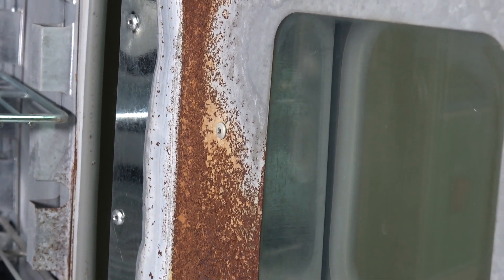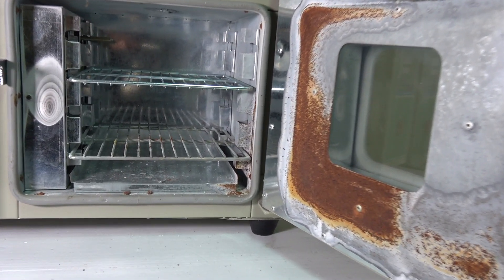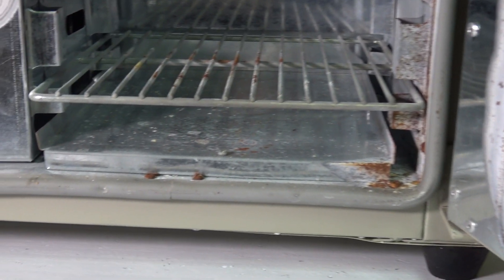This problem would all have been avoided if I was being a little more foresighted at the time of purchase and paid the extra 100 bucks to get the stainless steel one instead. Well, I was a cheap bastard and now I'm stuck with this rusty oven.